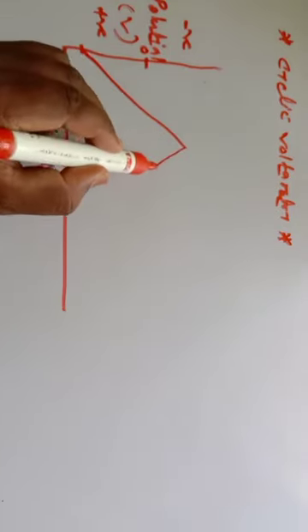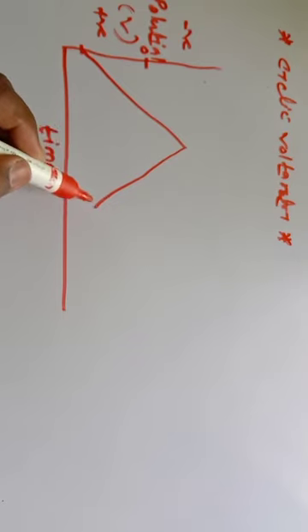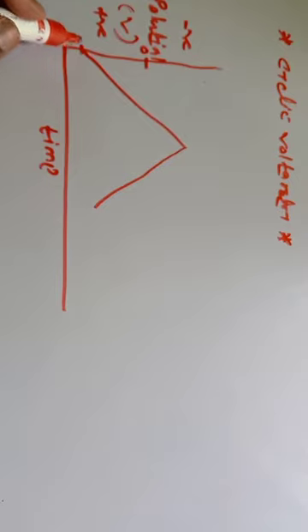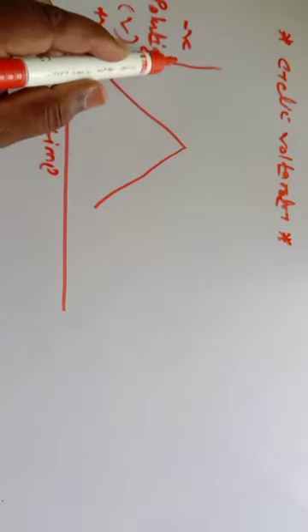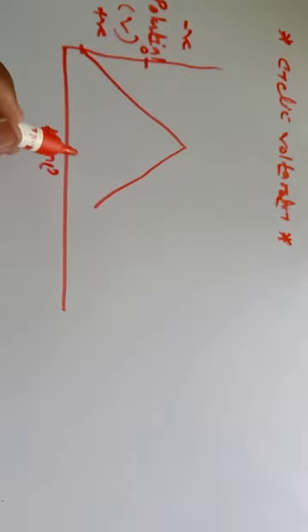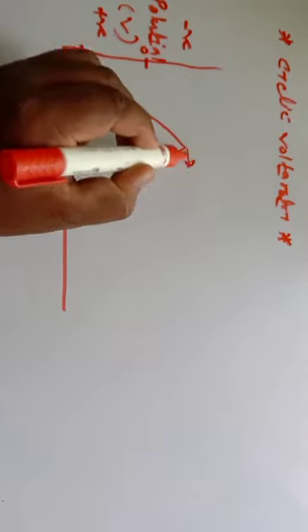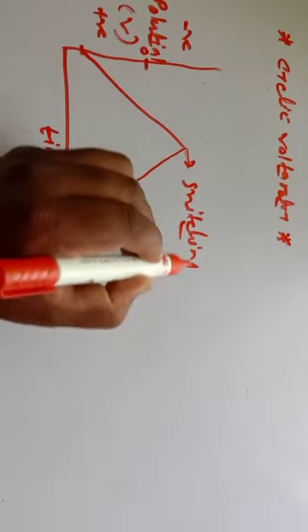So this is the scan. We go back to the original potential, and this point is called the switch potential or switching potential.